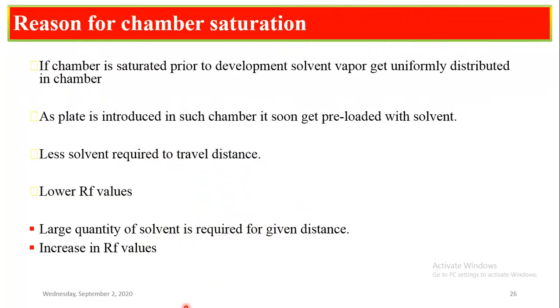Reason for chamber saturation: if we do not use chamber saturation, then certain problems will arise. First, uniformity will be disturbed. When a plate is introduced in such a chamber, it gets soon preloaded with solvent. Less solvent is required to travel the distance because the chamber is already at the saturation point.